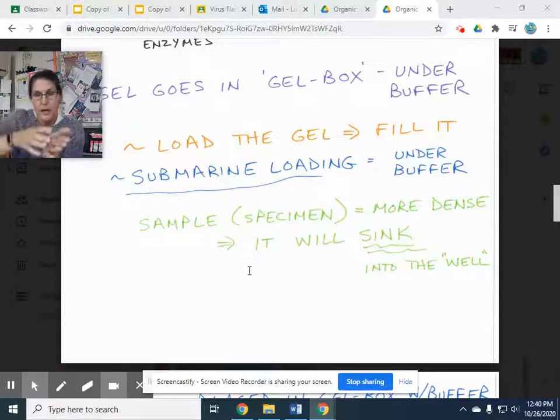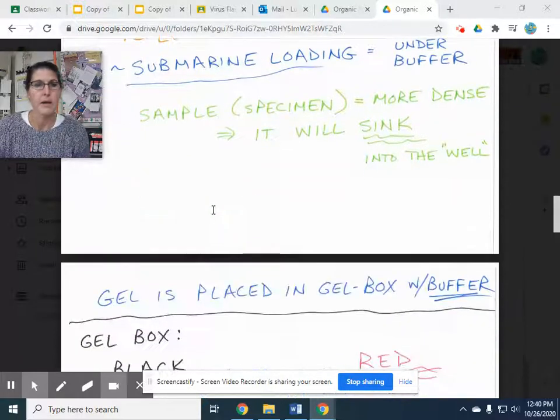Puncture through the gel, and then you have it all coming out the bottom into that buffer. But if you go slightly into that little hole with the tip and then slowly release, first push, second push, pull completely out before you let go of your thumb, and then everything should sink down there. The problem is if you're not close enough, you could cross-contaminate your other wells, which we don't want to do. So we'll make sure that tip is slightly into those wells.